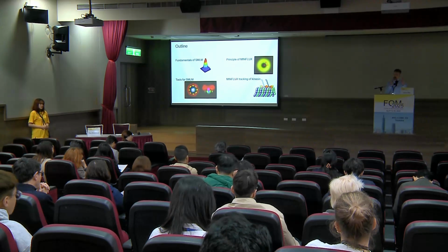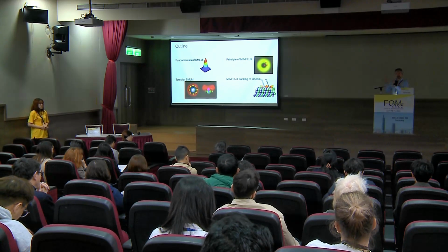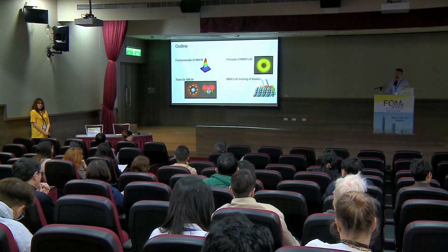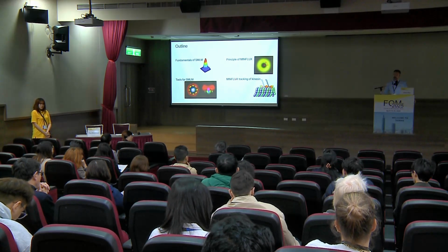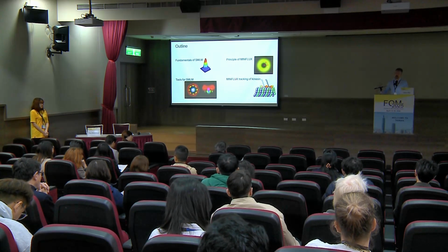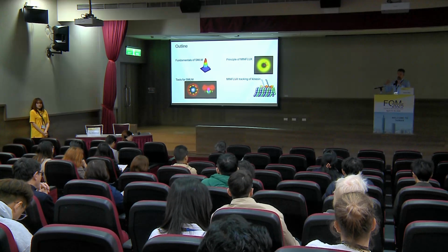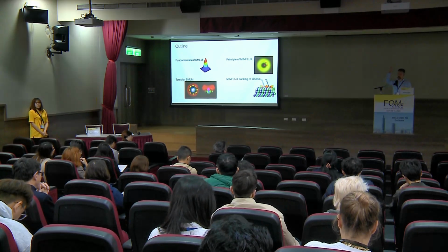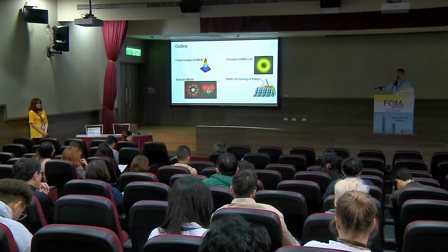We only need to use one channel, and then if you want to do dual color, we can do that easily, so we can use the two channels for dual color. So it's simpler, and we don't see much of a performance drop. It is true that in astigmatic images, you have these deformed point spread functions. So depending on where you are in Z, you have a worse error in X or in Y. So you sometimes get these stripes.